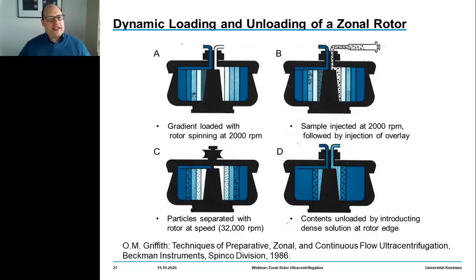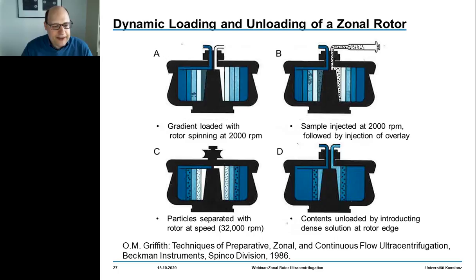Once the gradient is fully loaded, we start loading the sample, which is introduced via the center line. Then we remove the two-way fluid seal that allowed for dynamic loading, and accelerate the rotor to the speed required for proper sorting of the nanoparticles.